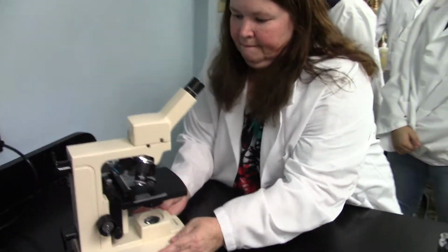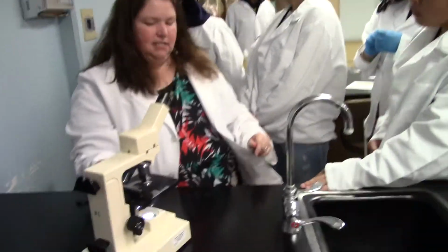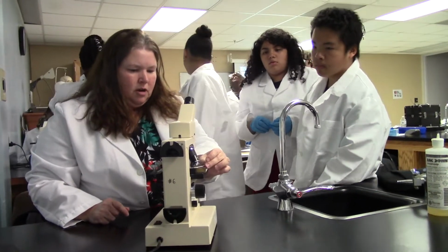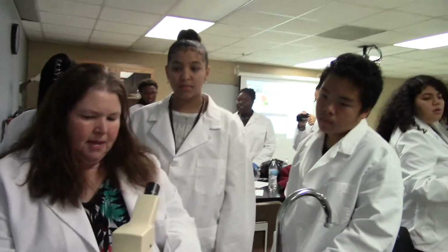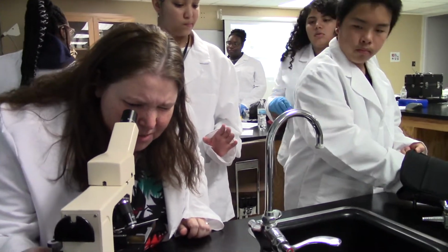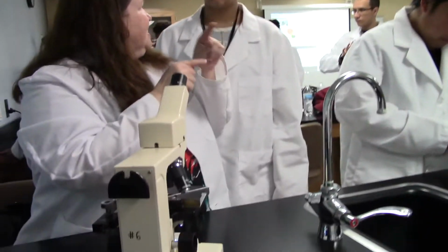Okay, lowest aperture because it doesn't like light. Ready? You just take the capillary tube, and you can see him in there. So you want to put him over the lens area, and then your lowest. When you're ready to time, you want to get him so you can see. Oh, it's pretty good. I mean, they've been quiet. He is folded up on himself, but that's okay.